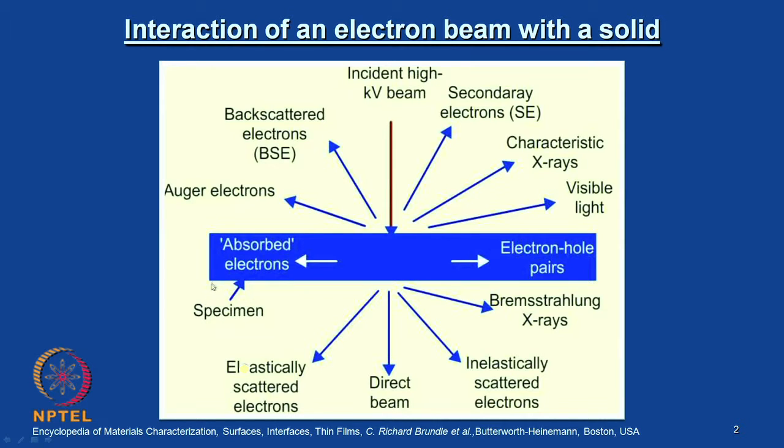What is shown in this slide is you have a specimen, and this is an incident high energy electron beam which is falling on the sample. And then you get to see quite a bit of signals coming out of this sample in all directions. So, I would like you to carefully look at each one of them.